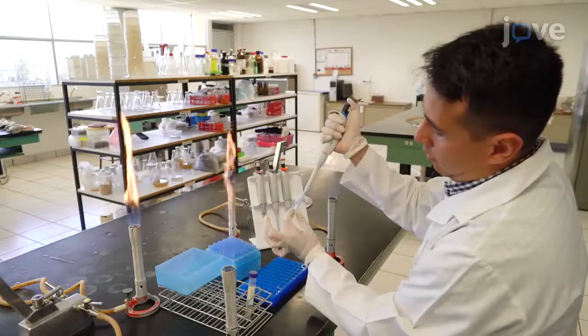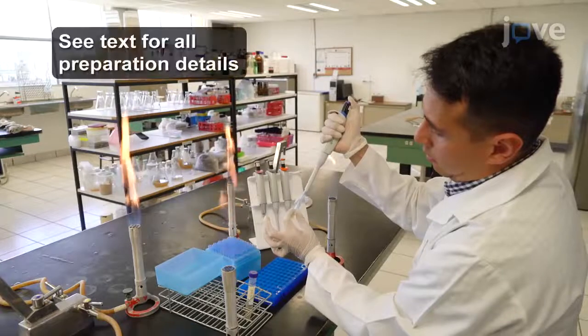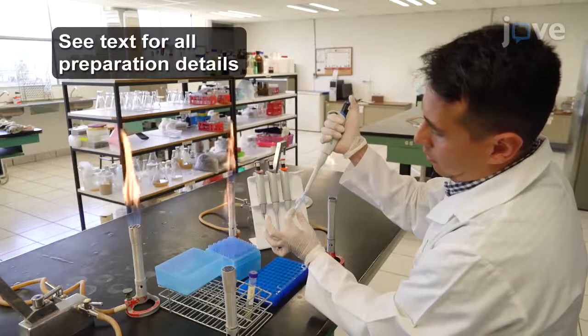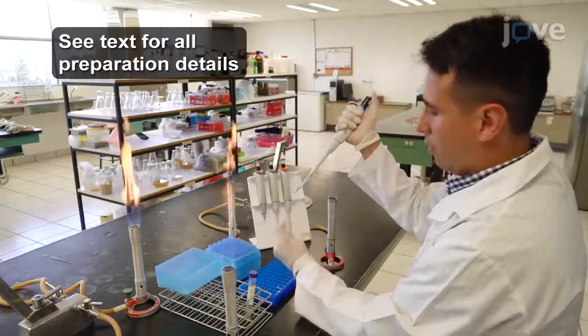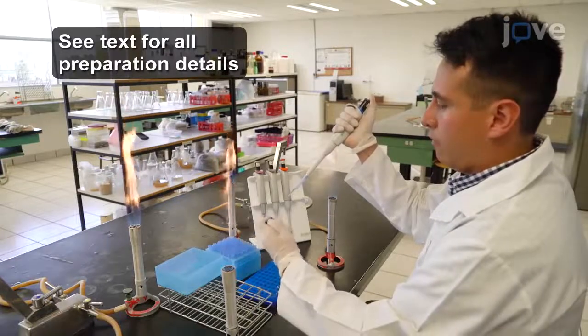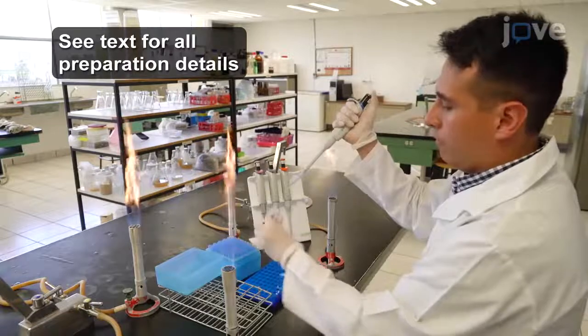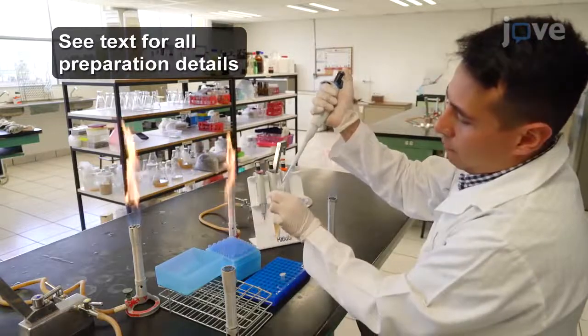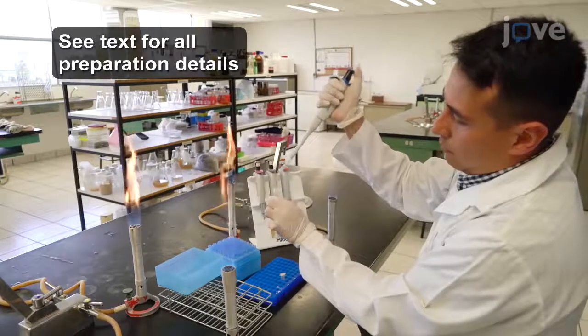Begin by inoculating a 15-milliliter conical tube containing 3 milliliters of cold sterile 2% yeast extract peptone dextrose (YPD) broth with 250 microliters of S. cerevisiae cells preserved in glycerol at negative 20 degrees Celsius.